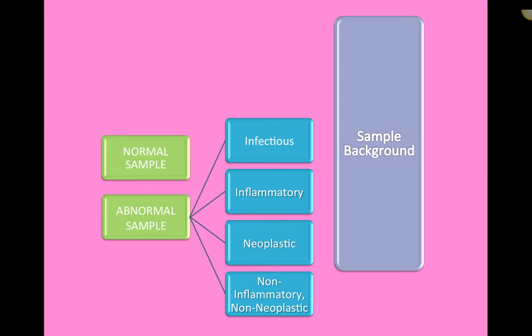So of course when you get a sample in front of you, you need to look at the types of cells that you're seeing, classify your sample appropriately into one of those categories, subclassify appropriately, as the other chart goes into in one of your previous PowerPoints. And then the last step as well is to comment on the background. So what are you seeing in the background?